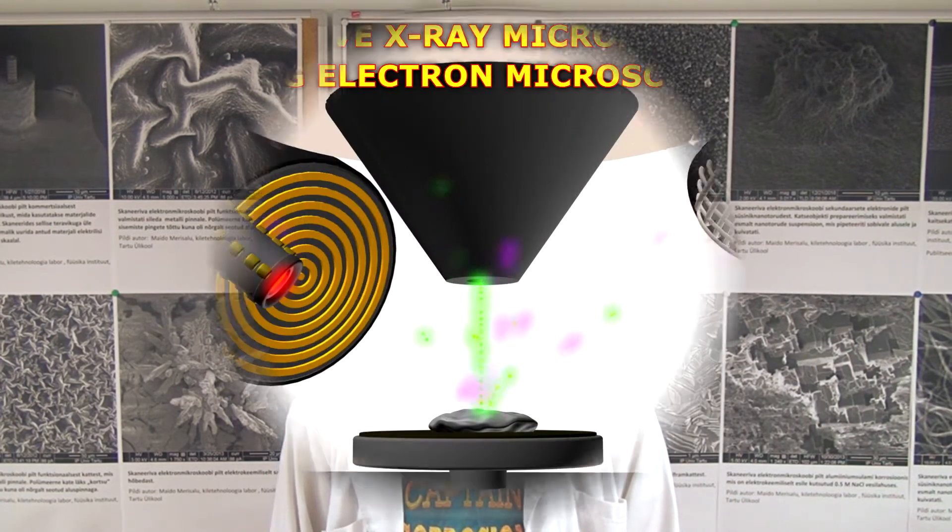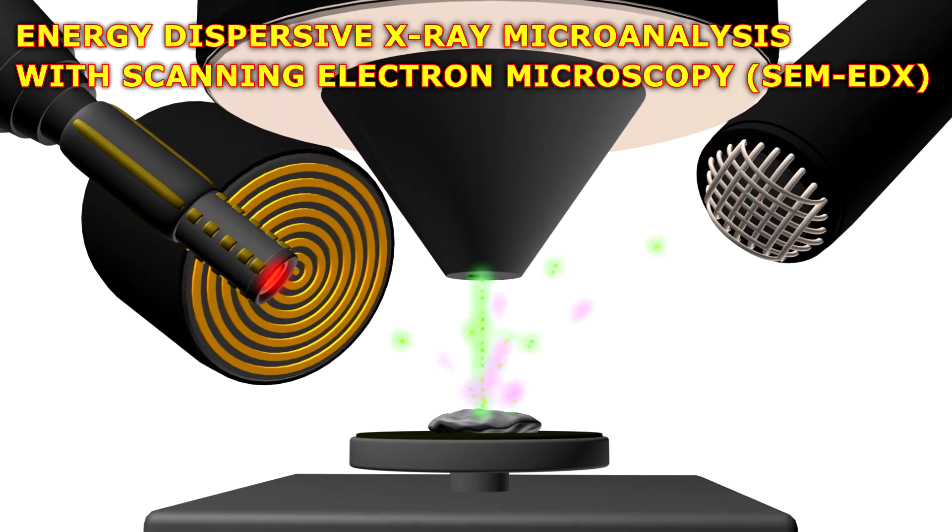In order to answer these questions, we will demonstrate how a real meteorite is studied in a laboratory under the scanning electron microscope by using energy dispersive X-ray microanalysis.